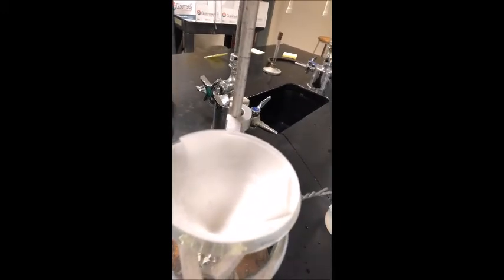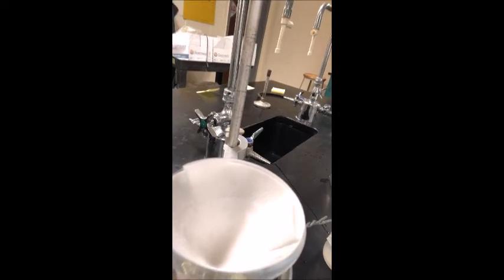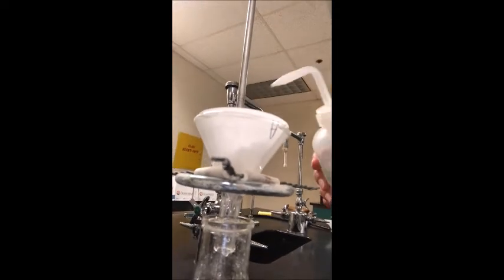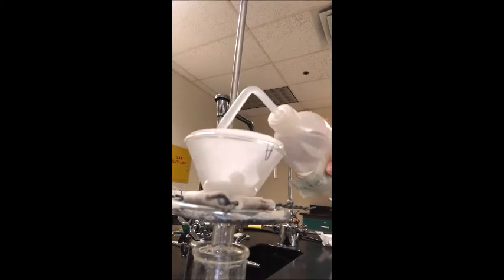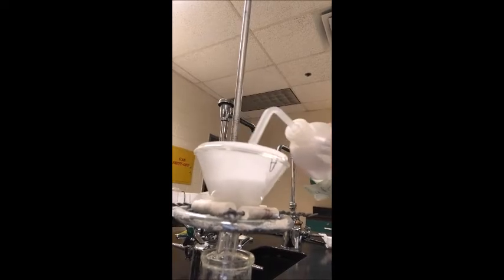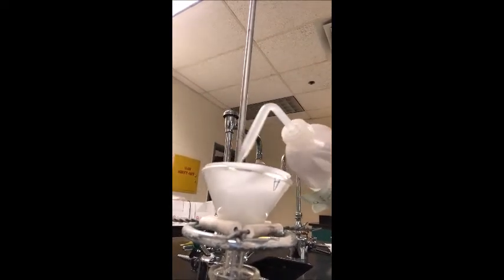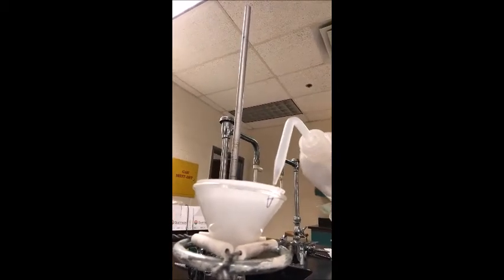Okay, so I'm not sure you can see, but the white precipitate is now on the paper there. So what I'm going to need to do is wash it a few times and make sure that there's no residue that's sticking on there that shouldn't be on there. So I'm going to take my wash bottle and just rinse the filter paper, rinse all the white stuff like 2 or 3 times. I'm going to do this for all of the samples. So again, we want to make sure that we're only collecting the calcium carbonate. So we're going to wash it a few times and let that keep filtering.